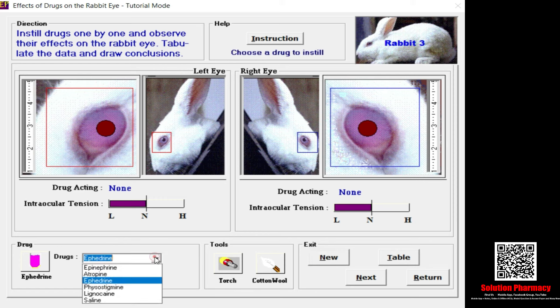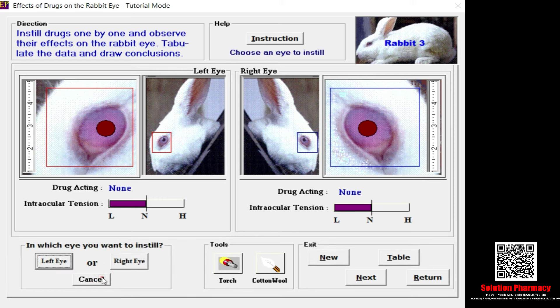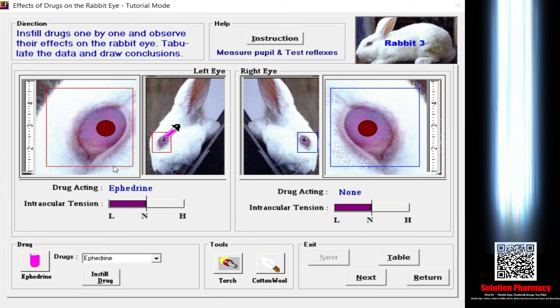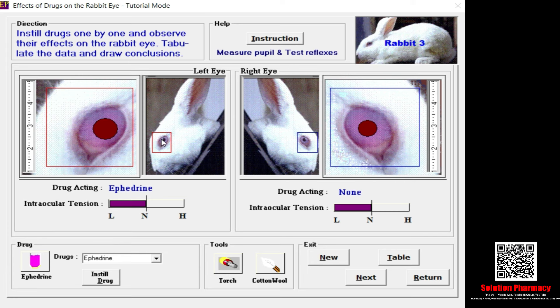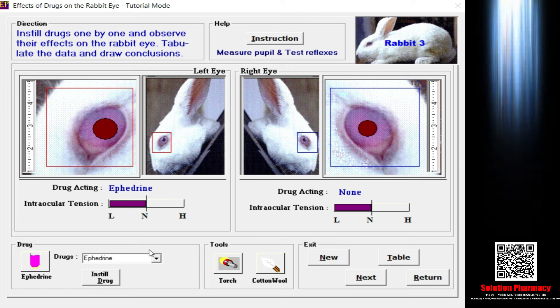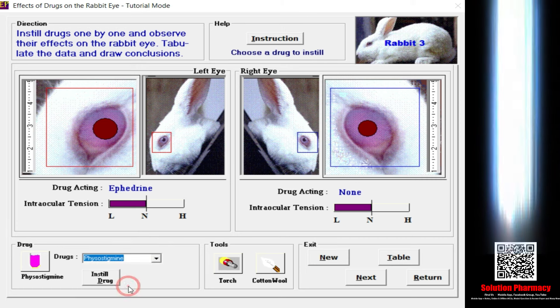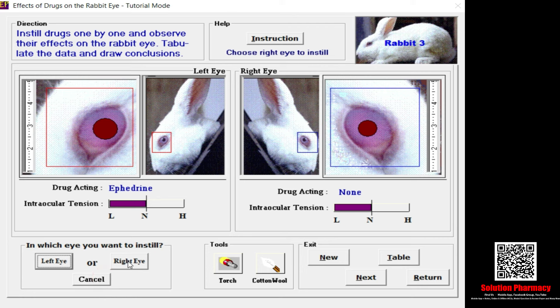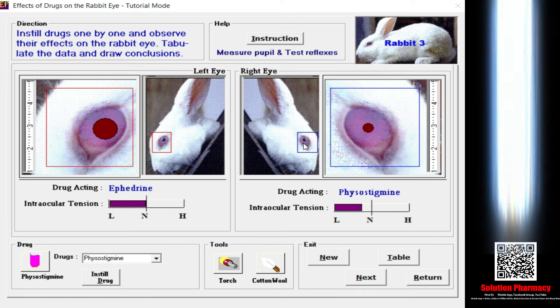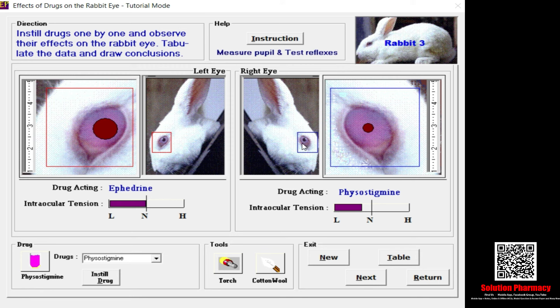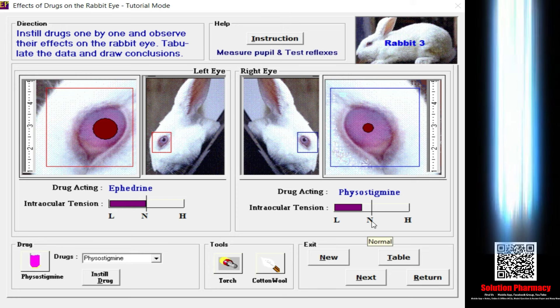Now I repeat the process with the new rabbit. I select epinephrine, instill the drug, and select the left eye. After instilling, the pupil size increases — this is mydriasis. In the case of epinephrine, intraocular pressure remains normal. Then I select physostigmine, instill the drug, and select the right eye. After placing the drug on the right eye, you can see changes in both intraocular pressure and pupil size — this is miosis, meaning the pupil reduces in size, and intraocular tension also decreases toward the lower side.